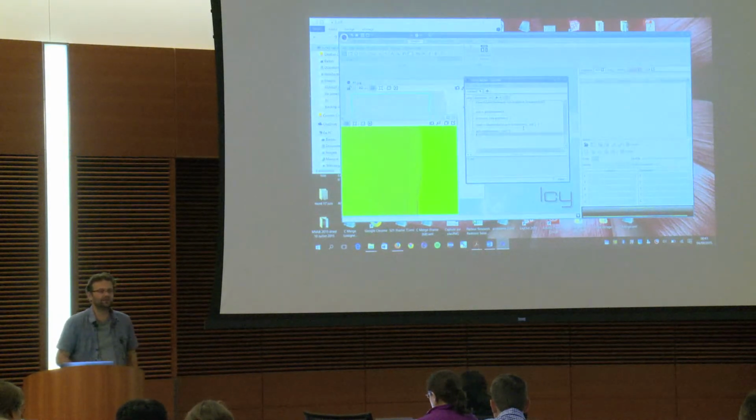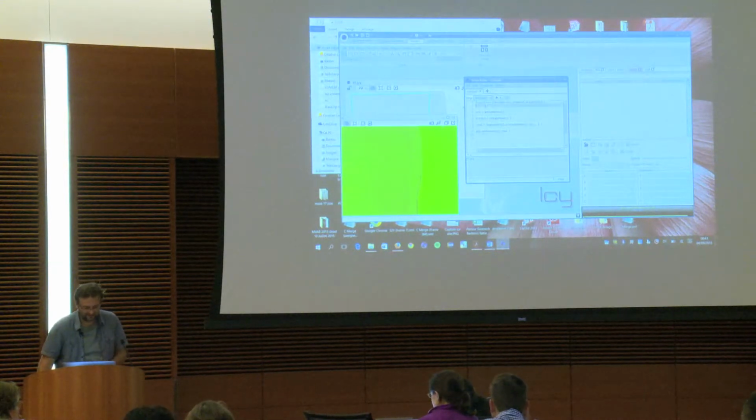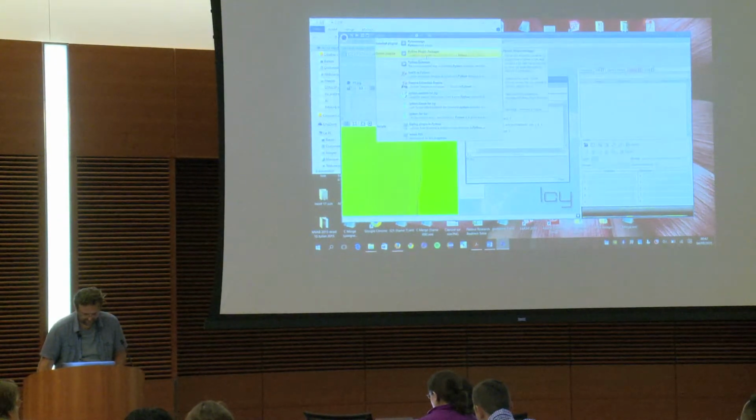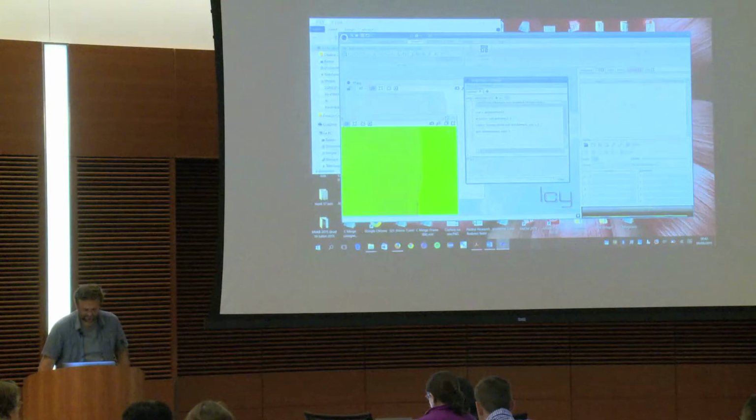And if you install a plugin, it will be this easy to access the capability of the plugin. So really huge effort on the scripting. It's not a specific language, it's really JavaScript. And if you want to switch to another thing, you click here. But here I didn't install Python, but if you do this, Python, I click here. Oops, sorry. So Python. Where is it? Yeah, it is this one.